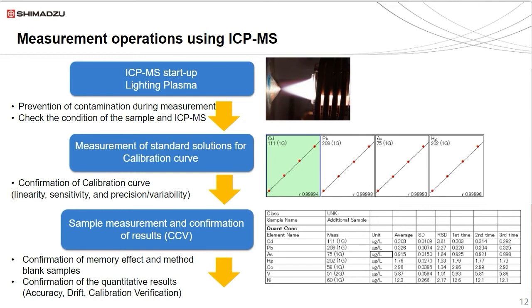The calibration curve linearity, sensitivity, and precision are verified. Accuracy is verified by running confirmation tests: continuing calibration verification samples, which are standard solution dilutions run as unknowns. Blank samples are also run to determine limits of detection, signal drift, carryover, contamination, and overall performance of the instrument.